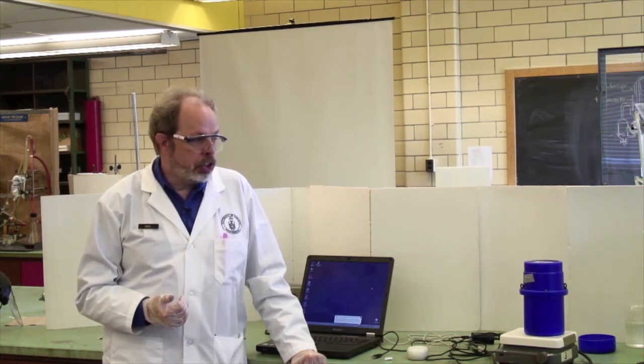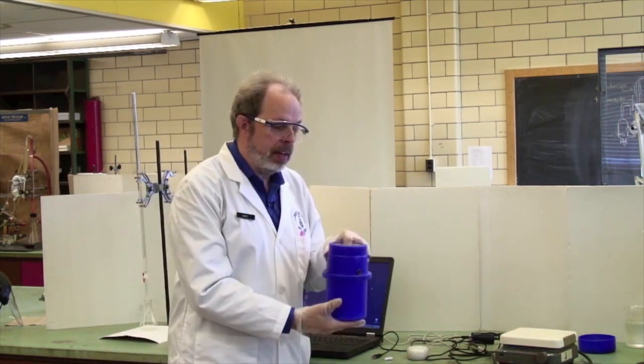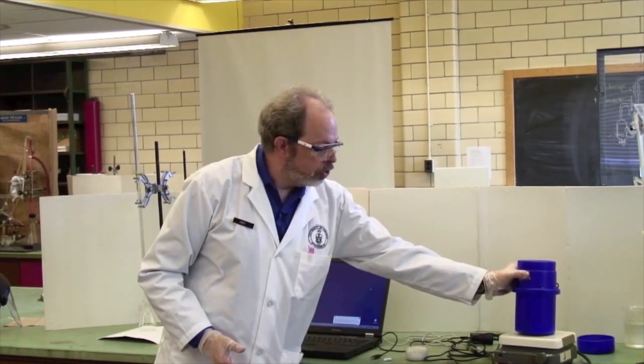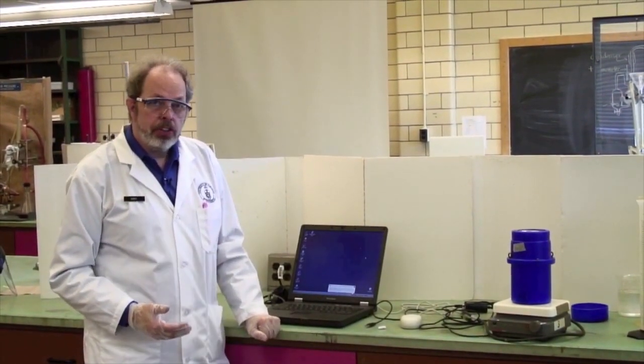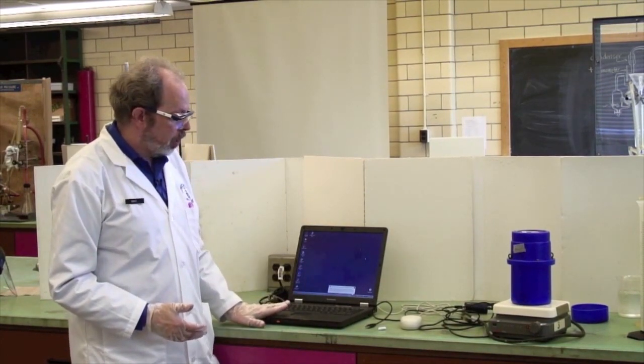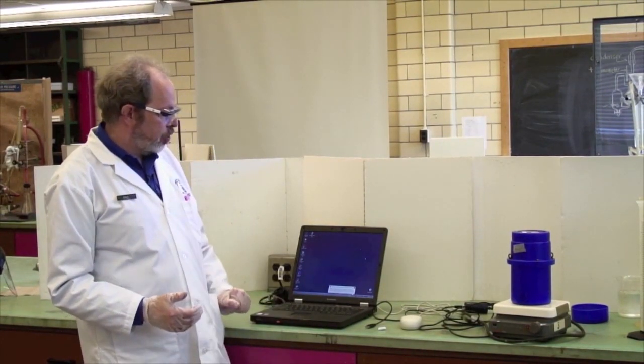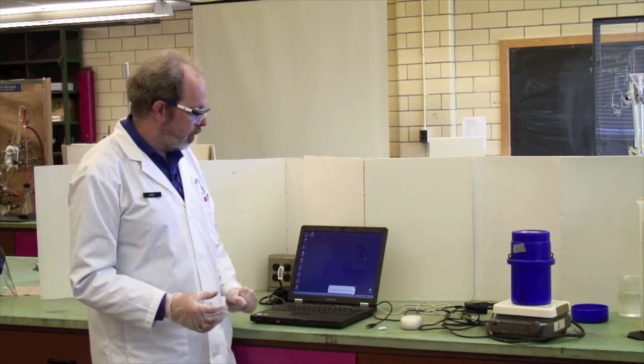The calorimeter is a Dewar flask or thermos flask. It sits here and it should sit on top of a stirrer plate. You are monitoring the temperature using a laptop. These are somewhat ancient.